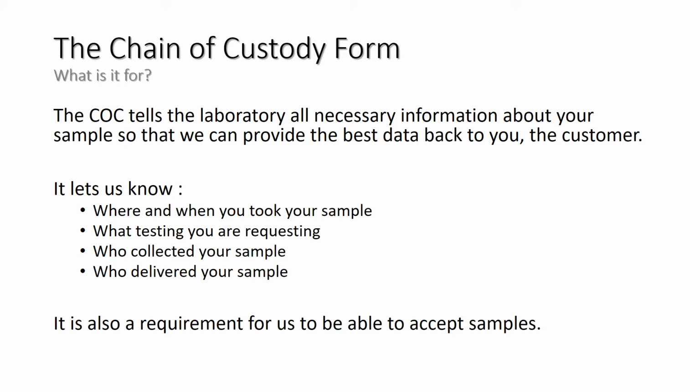The chain of custody is a required form for all samples submitted to the laboratory. It tells us necessary information about your sample so that we can process and analyze properly. In order to accept your samples, we need the information on the form.